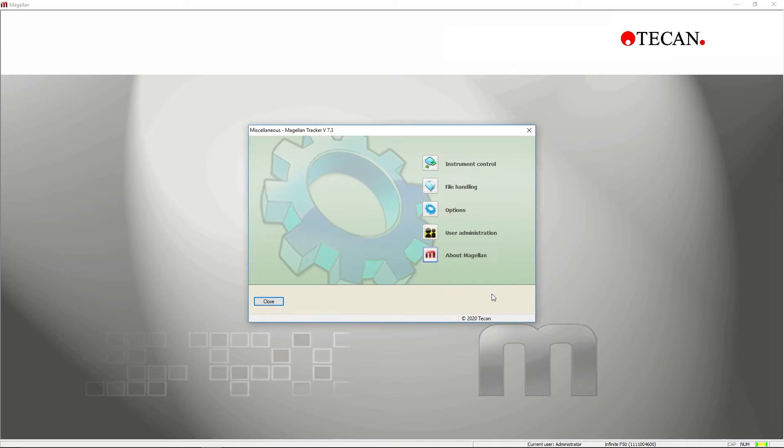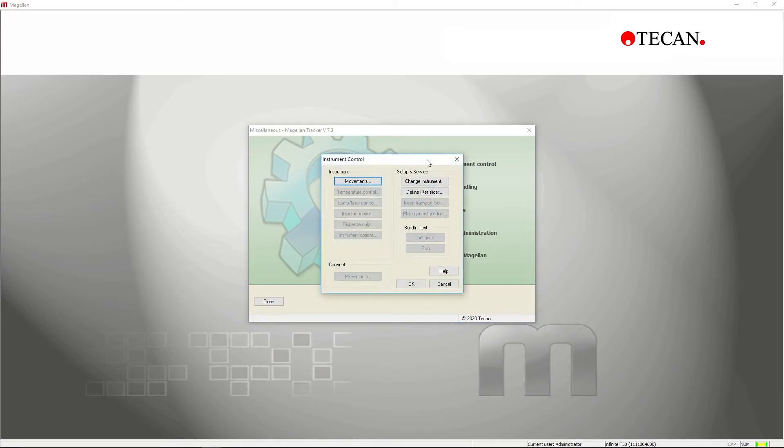You can also connect to your instrument in the Miscellaneous menu under Instrument Control.